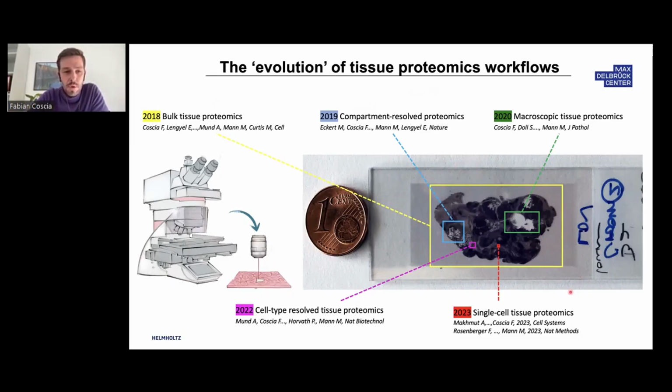But today, more and more labs, on the basis of these new sample preparation workflows I just mentioned, and highly sensitive mass specs, we can now include spatial information. So we have now the opportunity to also analyze deep proteomes from very few cells in the tissue microenvironment.